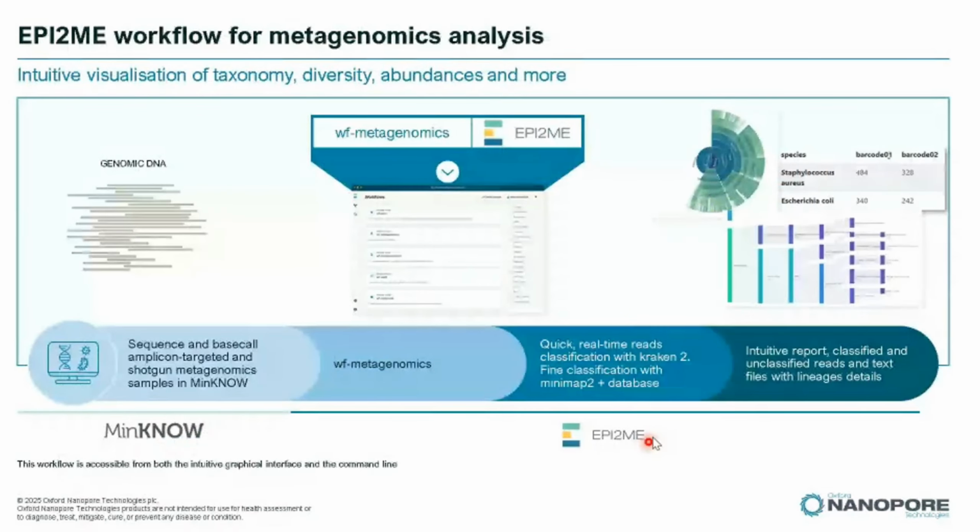So this is showing the workflow for the metagenomic analysis. Starting from the preparation of DNA, after getting the sequencing data, it is loaded into the EPI2ME analysis software, and finally the report.